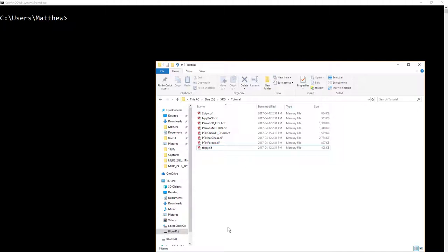However, journals do prefer you submit them as one file, so I'm going to show you this method. As a note, all of these files have the complete authorship, publication, and so on information in them. That's fine. The CIF format does not care if you list authorship five times inside the file. It just means that the authorship is associated with that particular structure rather than with every structure in the file.